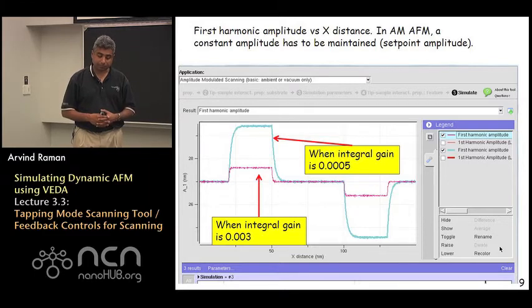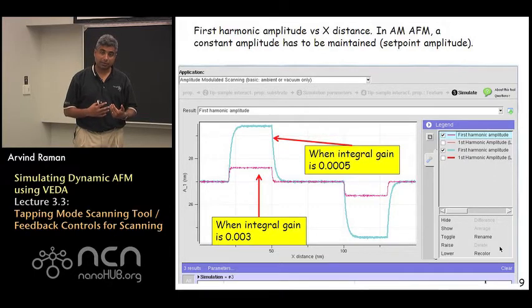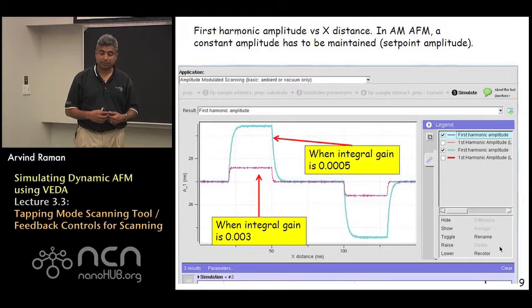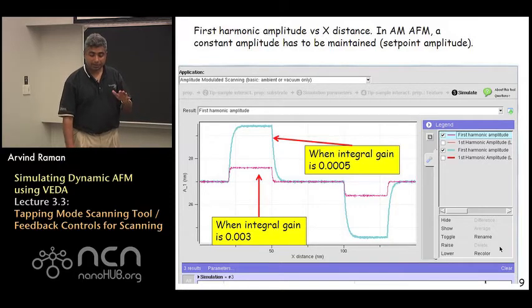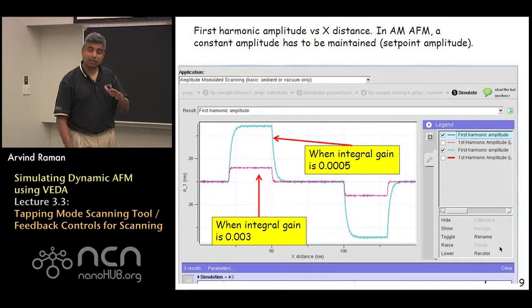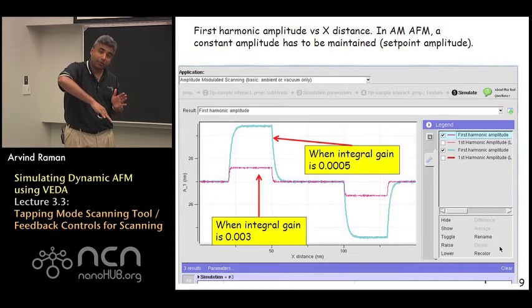You see that in the case when the integral control gain was kept low at the lowest value, 0.0005, the error signal was large. The amplitude actually increased and was not constant as you were going over the downward ramp of the trench.